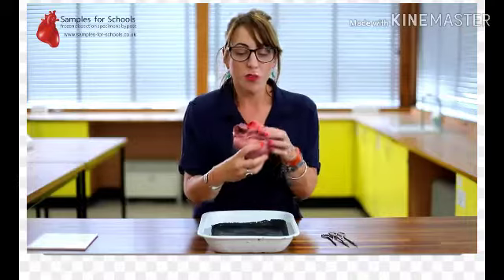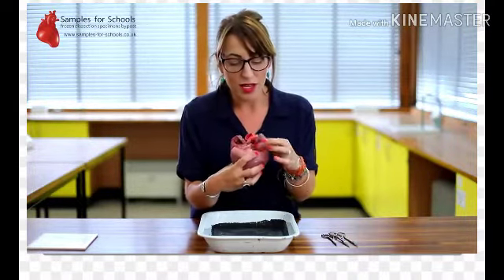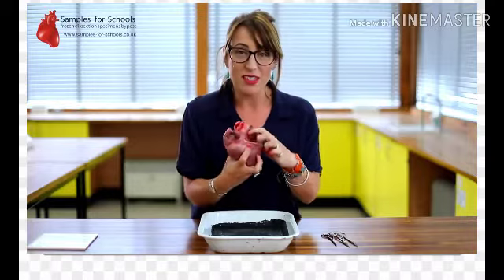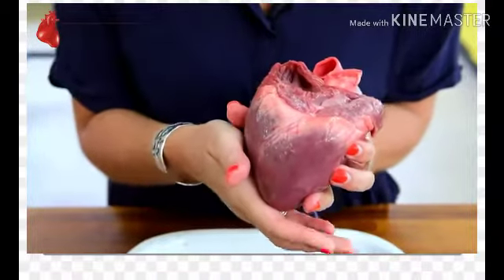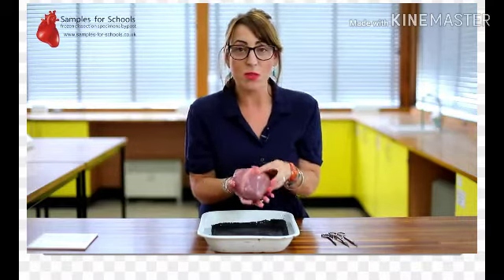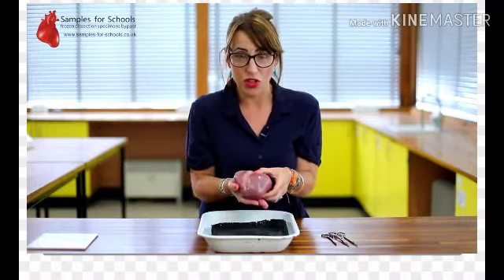We're going to be cutting open into the 4 different chambers of the heart to look at what each section does. Now, if we look at the outside of the heart, we can see just where the top surface lies is where the atria would have been. These have been trimmed off so that we can see the details of the inner cavity. So we're going to make our first incision onto this side of the heart, parallel to the coronary artery. Now, the coronary artery is the main blood supply to the heart tissue itself, so the heart has its own supply of oxygen and glucose.